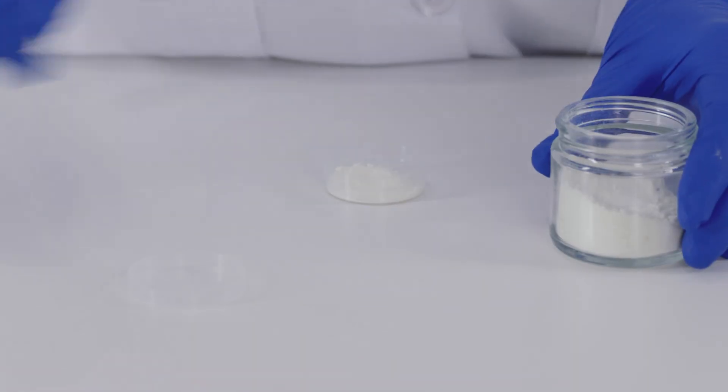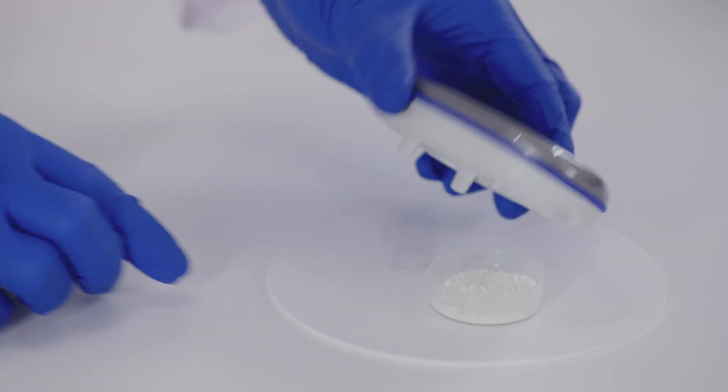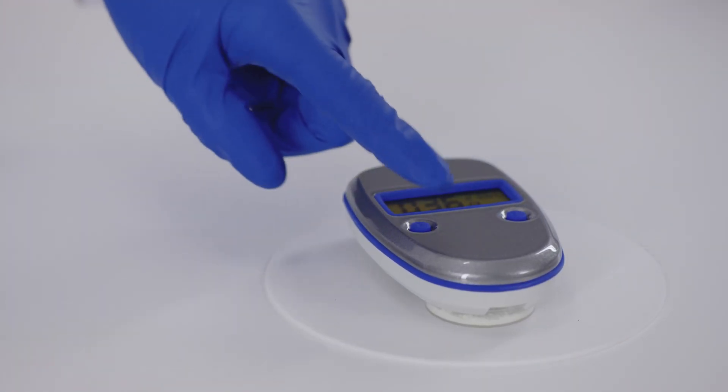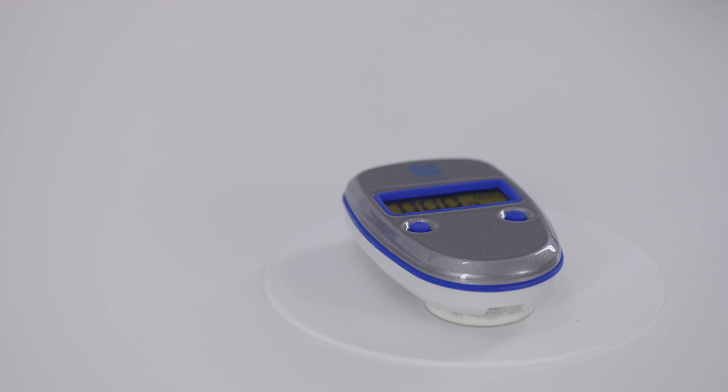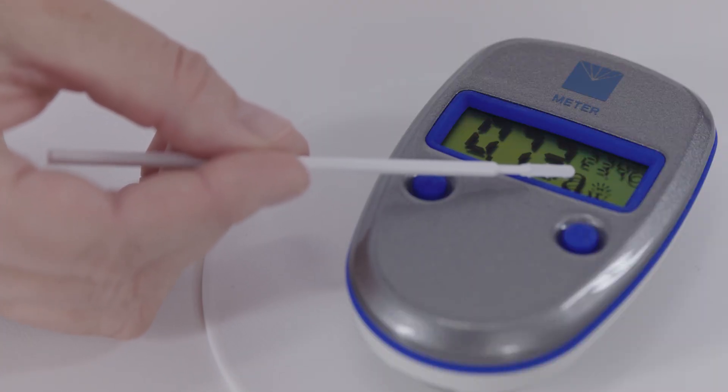Place the prepared sample cup onto a level surface. Place the open pocket onto the cup. If the instrument is not on, press the 1 button to turn on the instrument. Press the 1 button again to start the reading. Note that any time you press the 1 button, it will restart the measurement. The sunburst animation shows that the measurement is in progress.